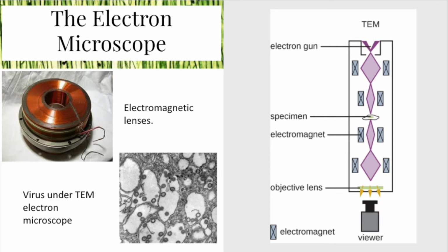Electron microscopes use an electron beam in a vacuum to view cells in far more detail. This is a narrow beam of electrons that passes through electromagnetic lenses. These lenses are actually coils that surround the tube and emit an electromagnetic field. This focuses the electrons and the beam strikes the specimen. The electrons are either absorbed, scattered or passed through. The image produced is either put on a screen or projected on a photographic plate.